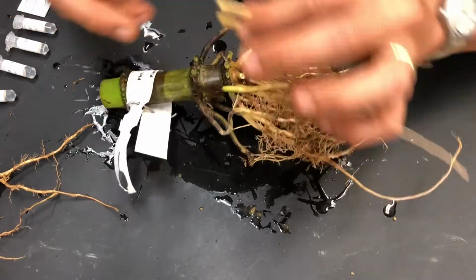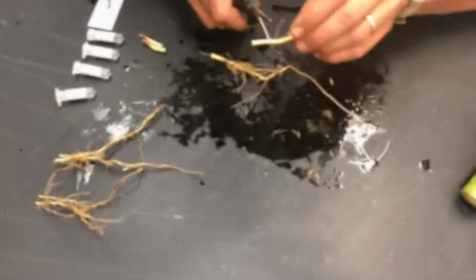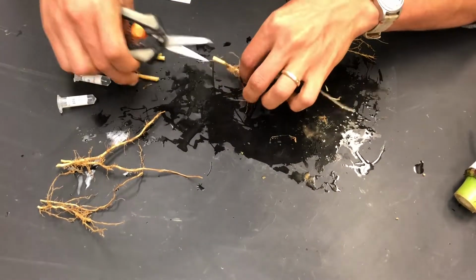It is important to be consistent in sampling location from crown to crown, and we typically focus on the basalmost 2 cm of each nodal root, right where they emerge from the crown.